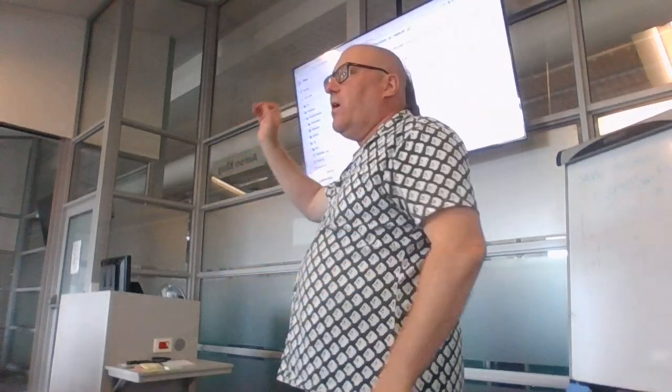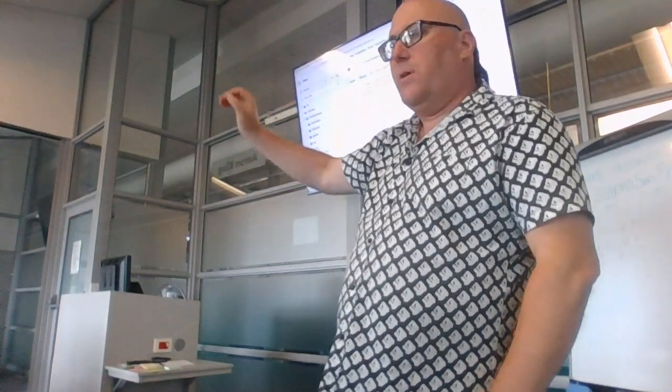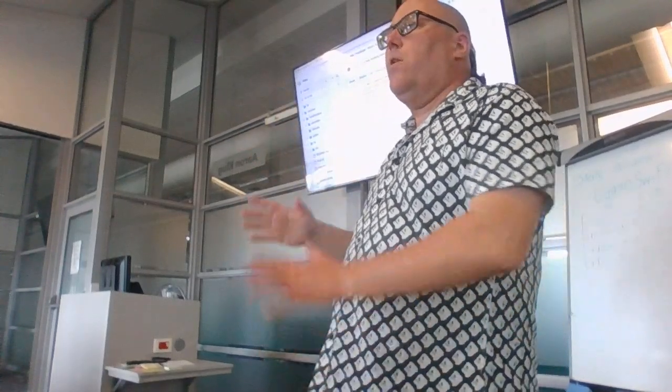The one option that I found is to identify which containers you want to download and download those ones ahead of time. The other thing that I've tried is to take a small sample and run it through the workflow so that it does all of the downloading of containers and things like that, and it's then ready for when you want to use it.